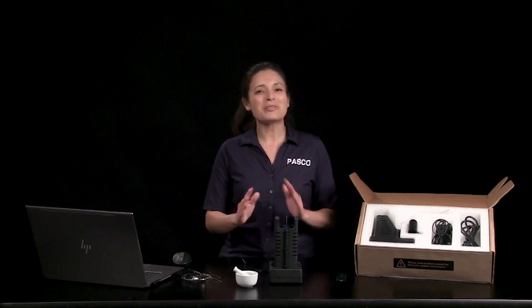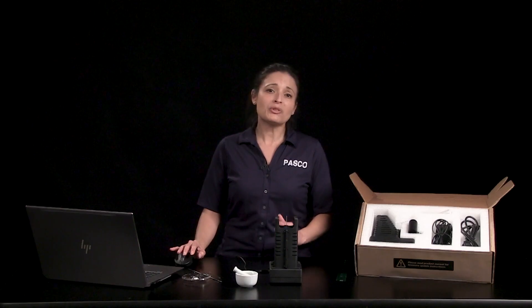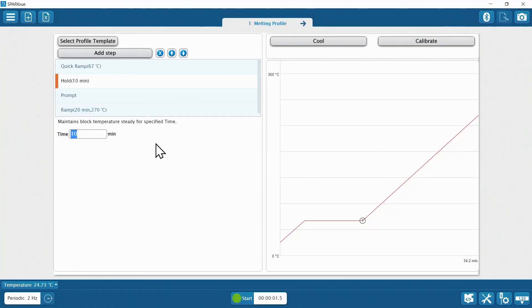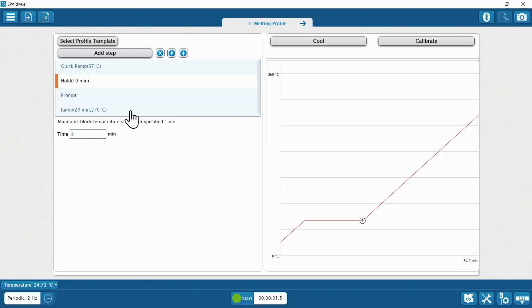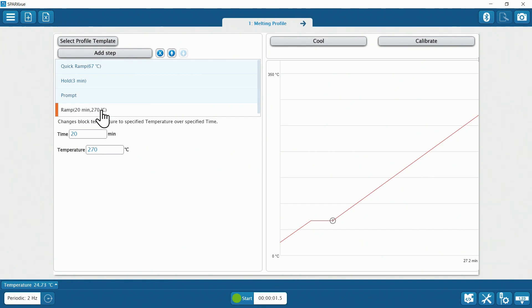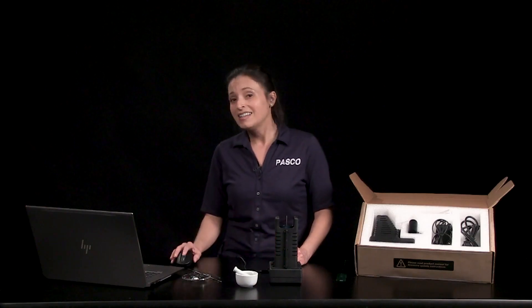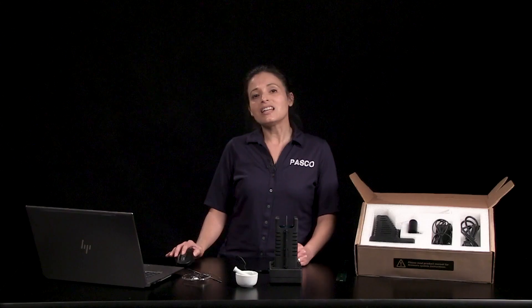Then you can reset the melting profile to default and design a more slow and controlled run. So if I thought I saw melting start around 69 degrees on quick ramp, I'd aim a couple degrees lower than that — let's say 67 — on quick ramp. I can leave hold set for 10 minutes, or if I'm short on time I can confidently reduce hold time to, say, three minutes, since quick ramp is programmed to have a tapered approach to the goal temperature. I'll leave prompt there to make sure I'm paying attention before ramp begins. A few minutes into ramp I should start to see melting from beginning and then through the end. I'll set the ramp temperature a couple degrees above the estimated temperature where melting was complete — let's say 71 degrees Celsius.